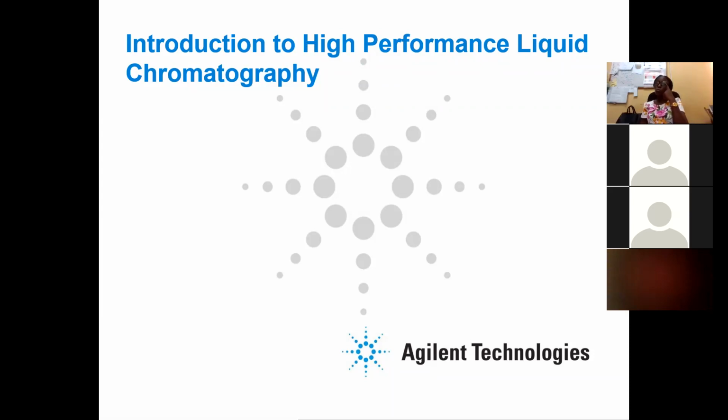Now, to quantify what I have, if I'm looking for a particular pesticide or drug residue, I will procure what we call standards. I will prepare my standard in different concentrations: 1 ppm, 2 ppm, 4 ppm, 8 ppm, 10 ppm. The standards, whose concentrations I know, I will inject into my HPLC.